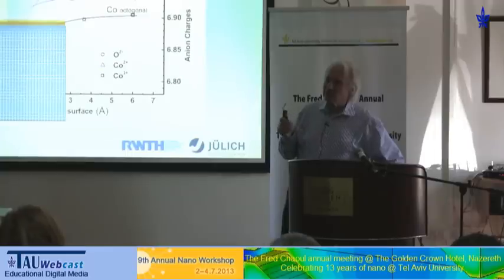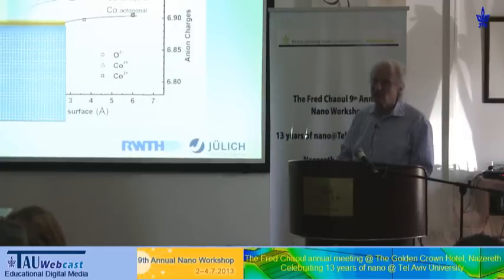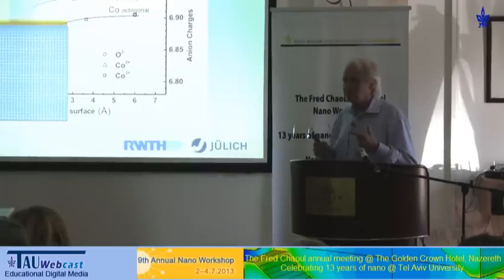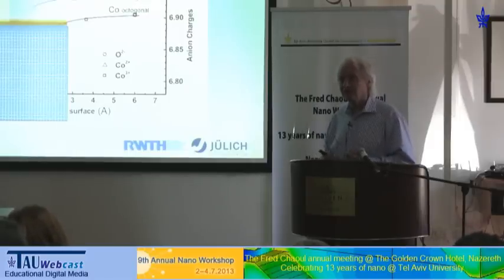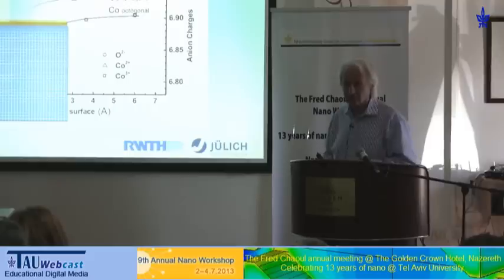So the other question, the second question, was specimen preparation. I think the specimen preparation nowadays is not really a problem. To prepare samples a nanometer or two or so thick is not really a problem. But this does not mean that you do it today for tomorrow's electron microscopy session. Sometimes it takes a week until we have the proper specimen dimensions and orientations and surface qualities. We have not talked here about the surface qualities.